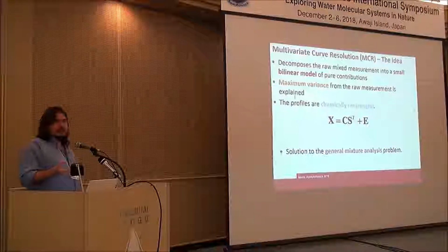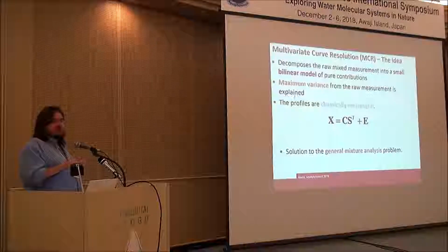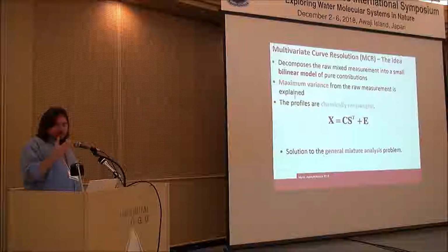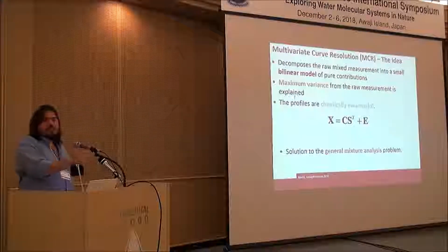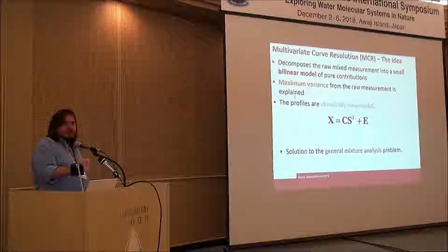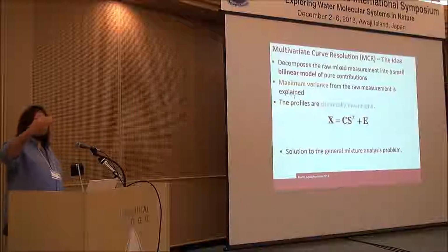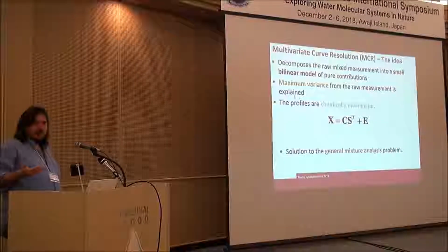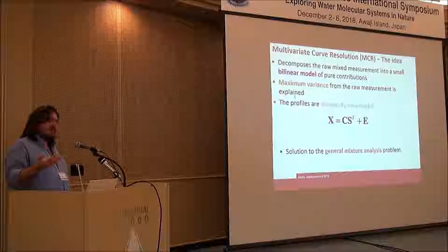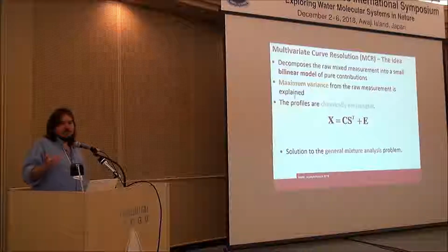So for such characteristics, we can think about curve resolution as an unsupervised exploratory tool, in a sense. Of course, the more information we have for our data, the more we will help the resolution. So if we know the profile of one of the pure constituents of our mixture, then of course if we input it, we may have better results. But it's not an obstacle when we don't have such information.